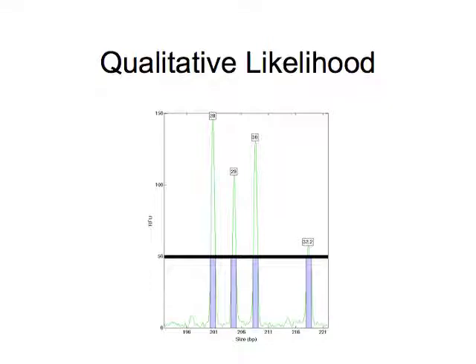This might be done using a hybridization assay, for example, where there would be very high certainty for larger amounts of DNA in a mixture as to whether or not the alleles were present or absent. Here we see represented in 4 blue vertical bars that a determination might be made using such an assay that qualitatively 4 alleles were present and no other alleles were.